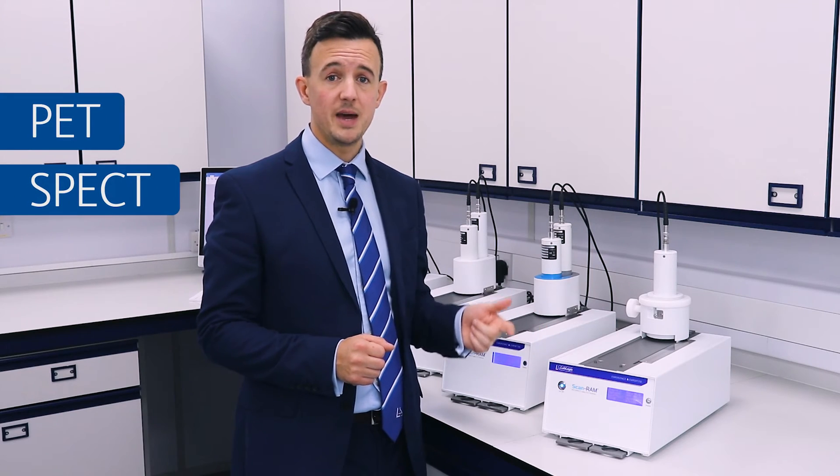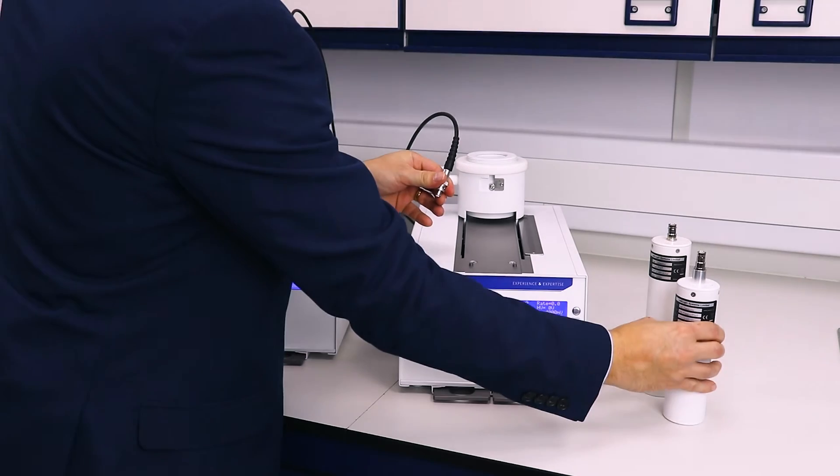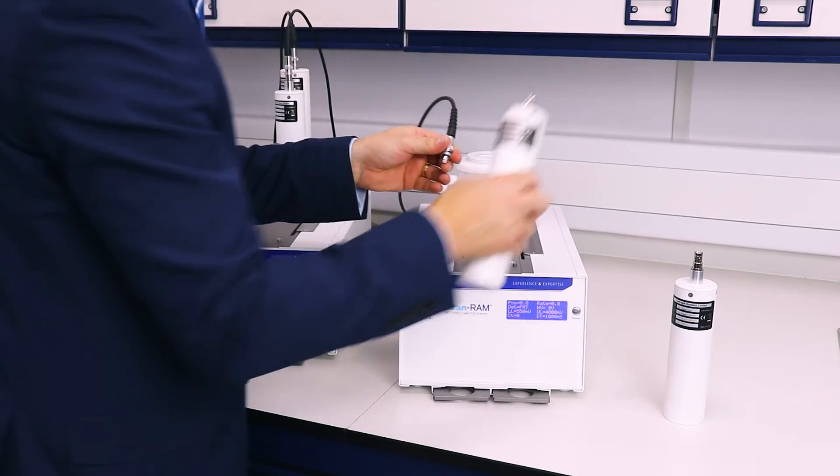A range of detectors can be used with the ScanRAM suitable for a variety of radionuclides including PET, SPECT, High Energy Beta and Alpha. The detectors can be easily changed depending on the radionuclide being detected.